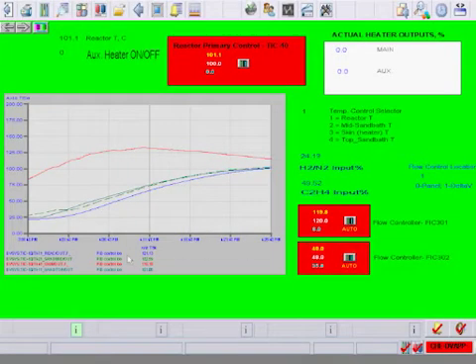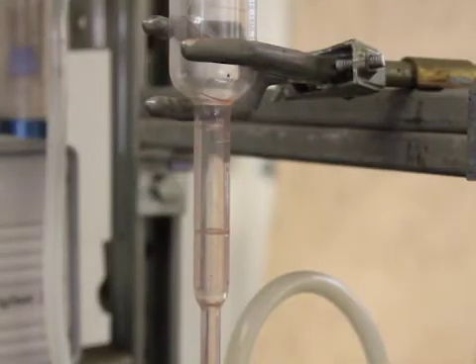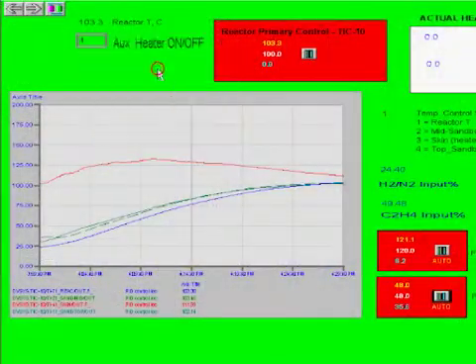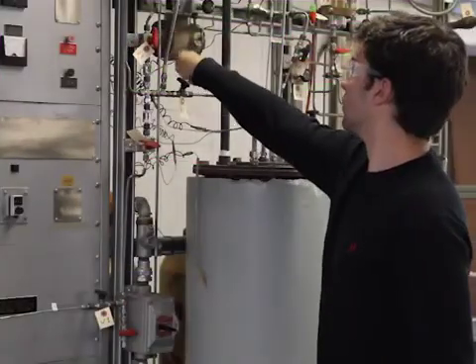When the temperature stabilizes at the set point, continue feeding the reactants into the reactor. Monitor product flow rate and temperature regularly. If product flow stops or temperature runaway occurs, quickly close the reactant valves and shut off all heaters, but maintain air flow to the sand bath.